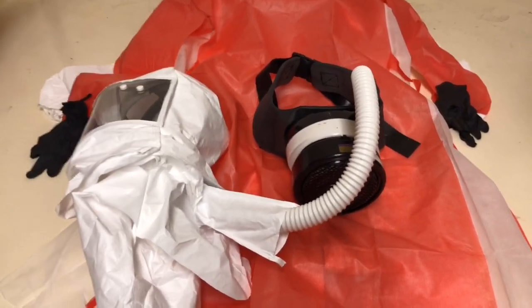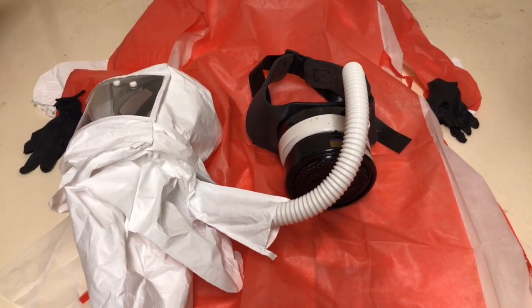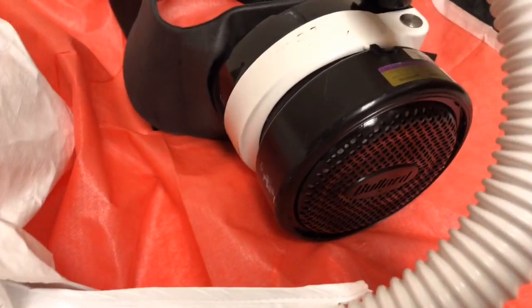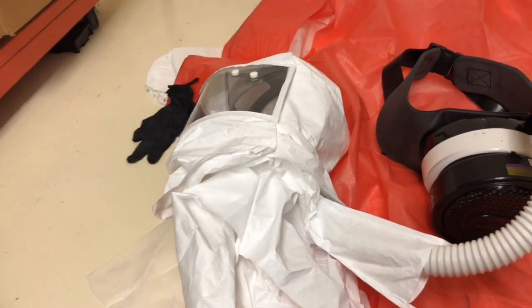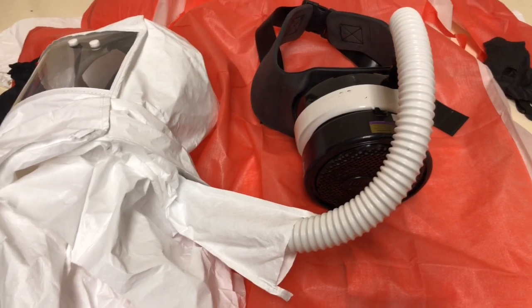So I think now everyone is well aware about N95 masks and surgical masks and all these ins and outs. We go even further. We use PAPRs. So here, air gets sucked through a big HEPA filter, gets purified, and that gets blown up into the hood that we then breathe the air through. So we're breathing completely clean air because it's being purified through the HEPA filter.